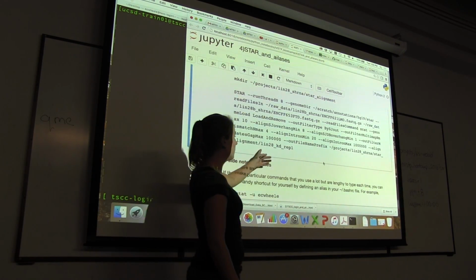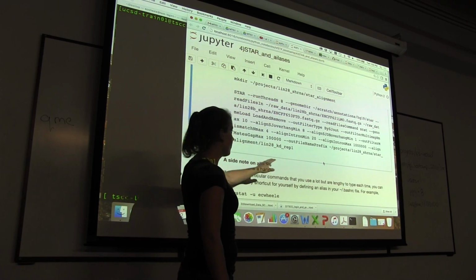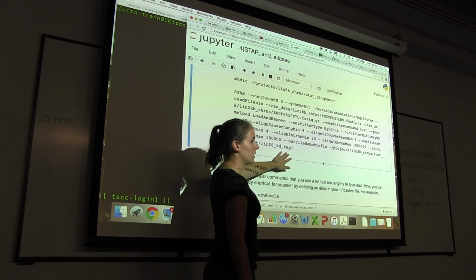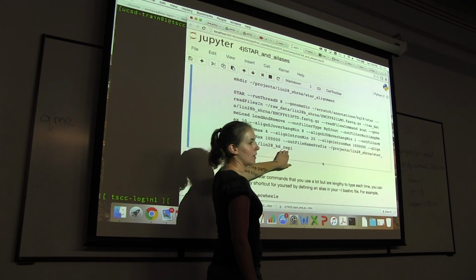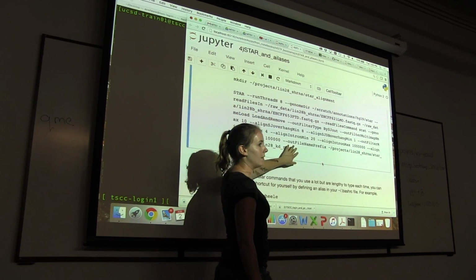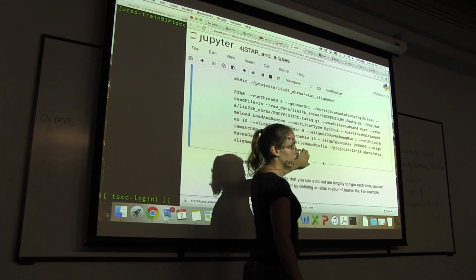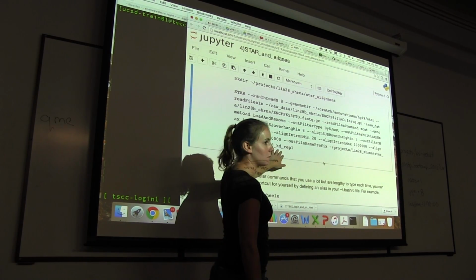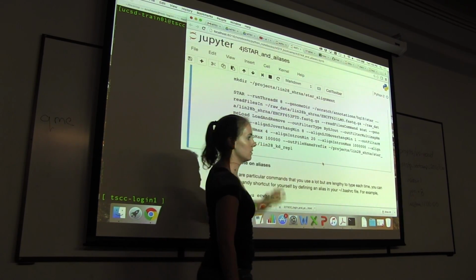Each alignment is going to generate multiple files, so it's asking you for a name prefix. Since we downloaded Lin28 knockdown data, replicate 1, this is the prefix that I want all of my files to have. Every file that gets generated will have its own suffix depending on what the file is, but I can match them to my experiment because they will all start with this.